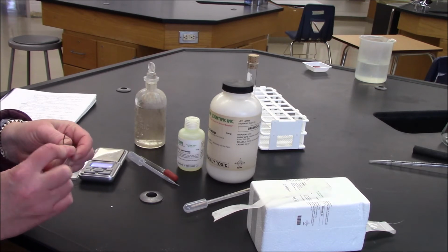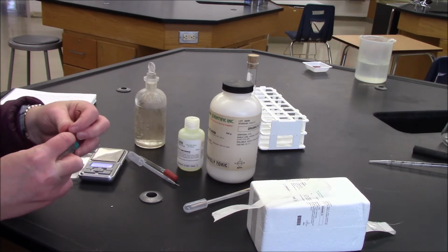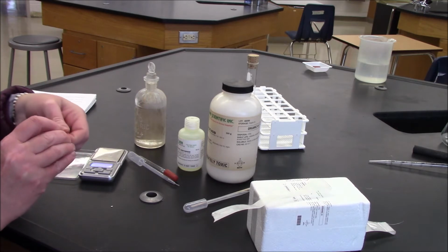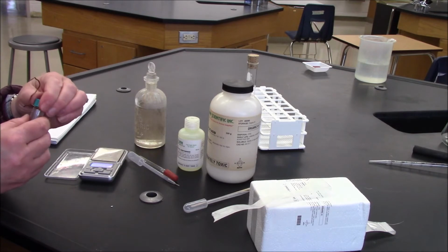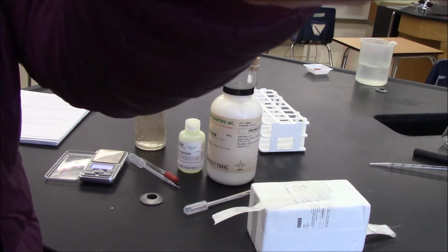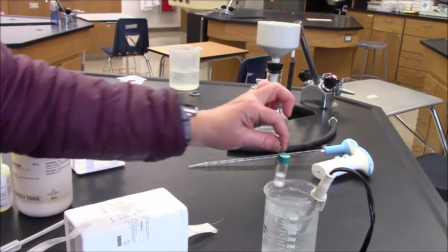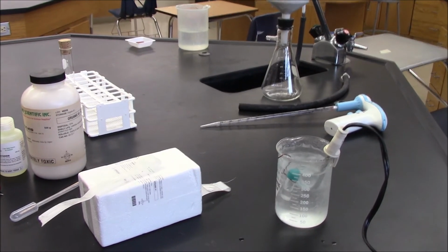During my 10-minute incubation period, I am going to be getting things ready. I have an ice water situation that needs to be set up. Okay, here we go. One more time. And so that you guys can see. In we go. All right, I'll see you guys in 10 minutes.